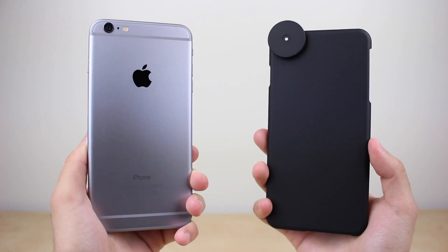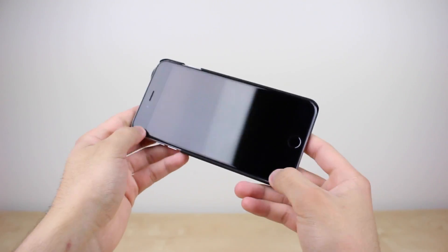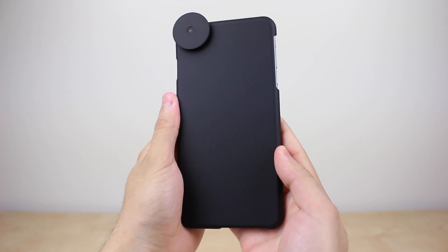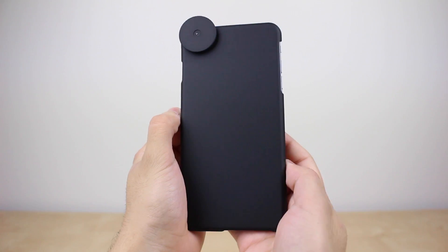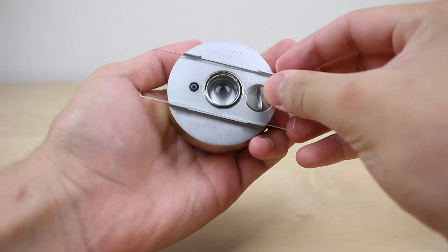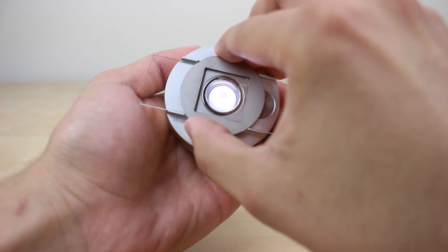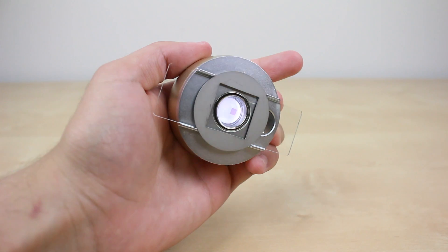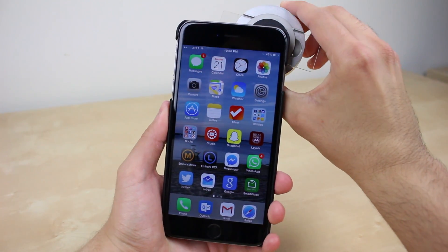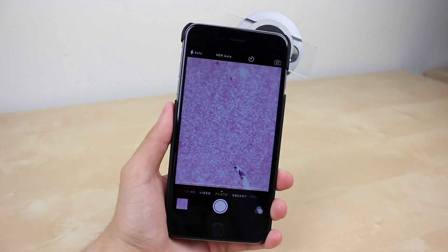Now there are several ways to use the U-Handy. The easiest way is by using their custom case, which is actually very easy to install and uninstall — definitely a plus. Then all you have to do is place a prepared slide into the light source with the subject facing up, ensure it stays in place with the slide holder which also activates the light, attach it to the case with magnets, and then use the camera app to zoom in, take a picture, or even a video.